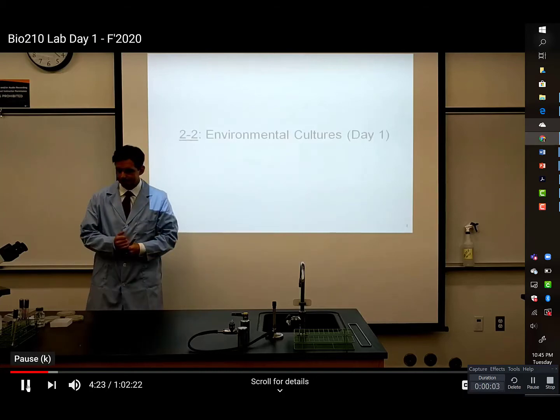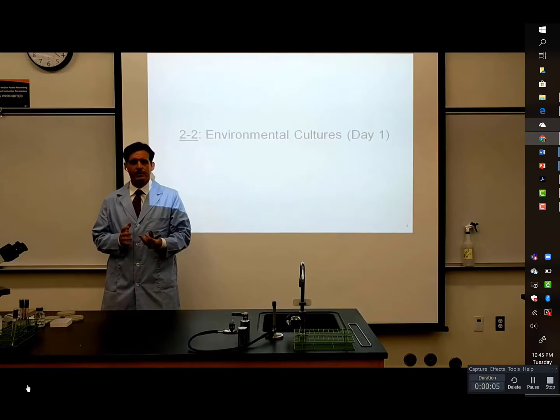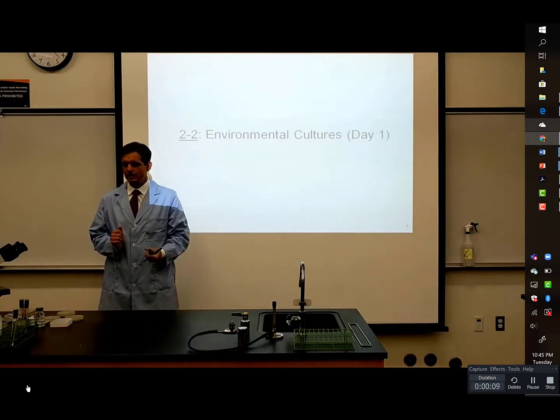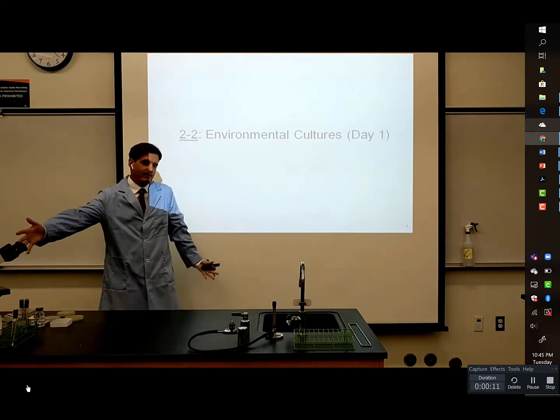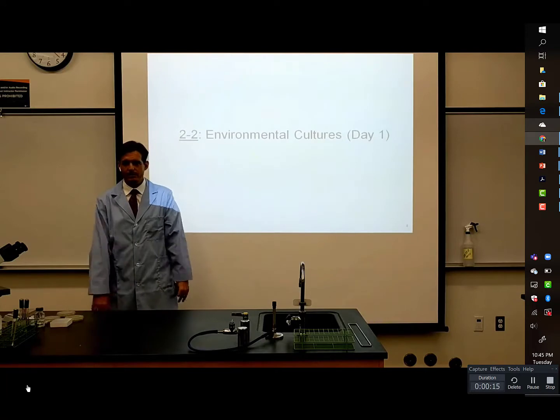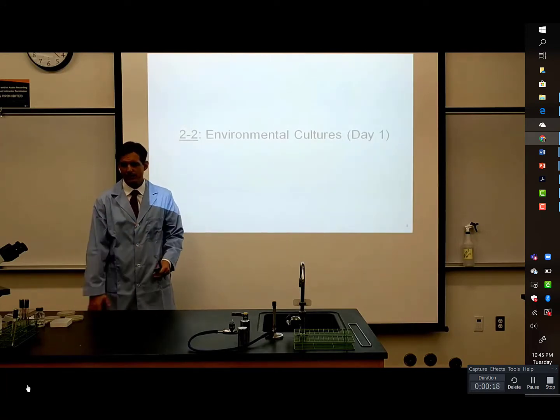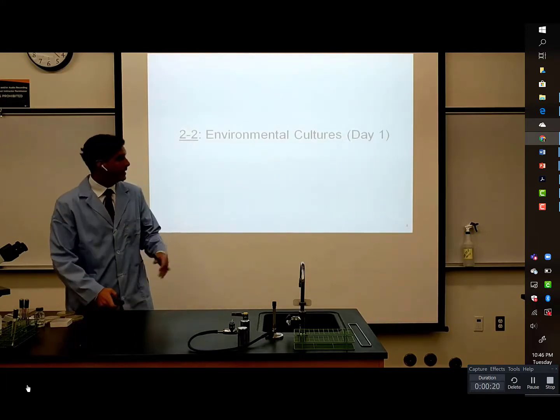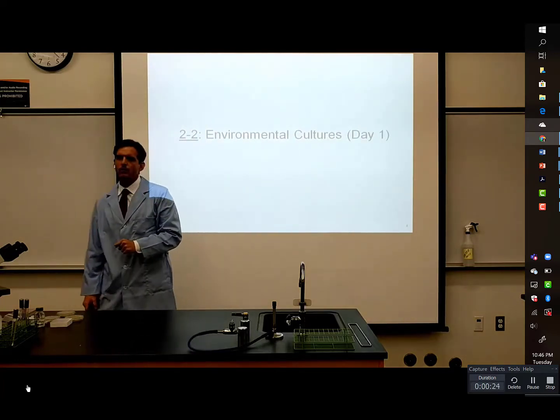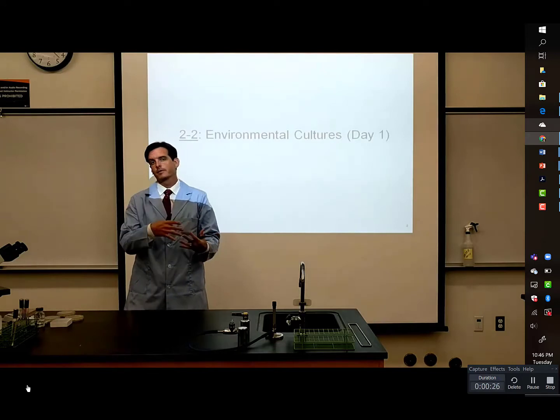All right, environmental cultures will be our first activity. One of the reasons I always start off with this one is because it doesn't require really much in the way of lab safety. As long as you don't trip and fall, I guess you'll be fine, right? So in this particular case, I'll show you this super easy, where we're going to take a sample from the environment, and we need to know what it means to culture something from the environment.